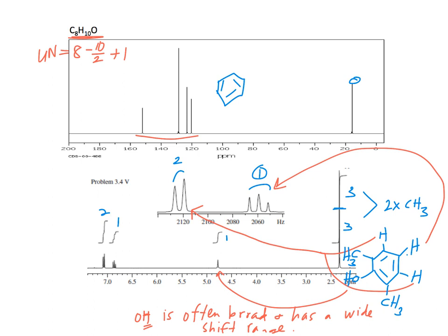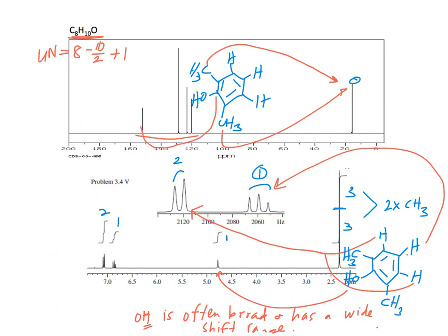Alright, so let's look at this upper one. Let's just draw it out again and see if we can pick out a couple of these carbons at least. OH. Both of the methyl groups have to be under this carbon over here, so it's symmetrical. They both give one single signal. Now the main one that we can see is the most downfield one, which is the one bearing the oxygen. Probably the other one, because this is in a 2-to-1 ratio, is that these 2 carbons go to this biggest one. And then it's a little unclear which ones go to the other ones. So this is what we might come up with for these structures.